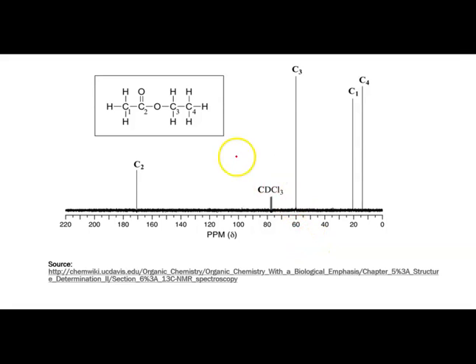This is a good NMR example for you to look at because it numbers the carbons and so it relates to the peaks, but we should walk through that just to make sure. We'll start with C4, which is just below 15. This group here, carbon 4, is a methyl group, well insulated, far away from that oxygen. This is actually a duplicate of one of the first slides that we looked at. At any rate, these hydrogens insulate that carbon's magnetic field, and so it is placed here closer to 0.